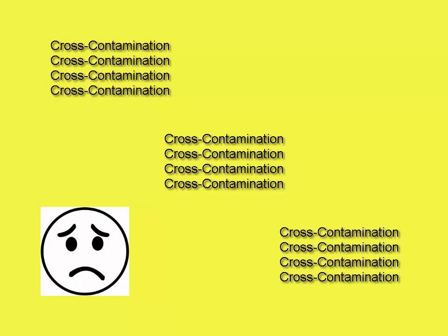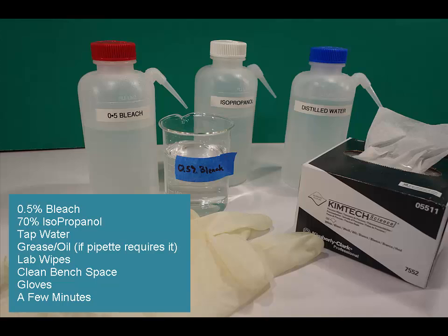Here's what to do when you get liquid inside the pipette barrel. You'll need 0.5% bleach, 70% isopropanol, tap water, grease or oil if your pipette requires it, and lab wipes.